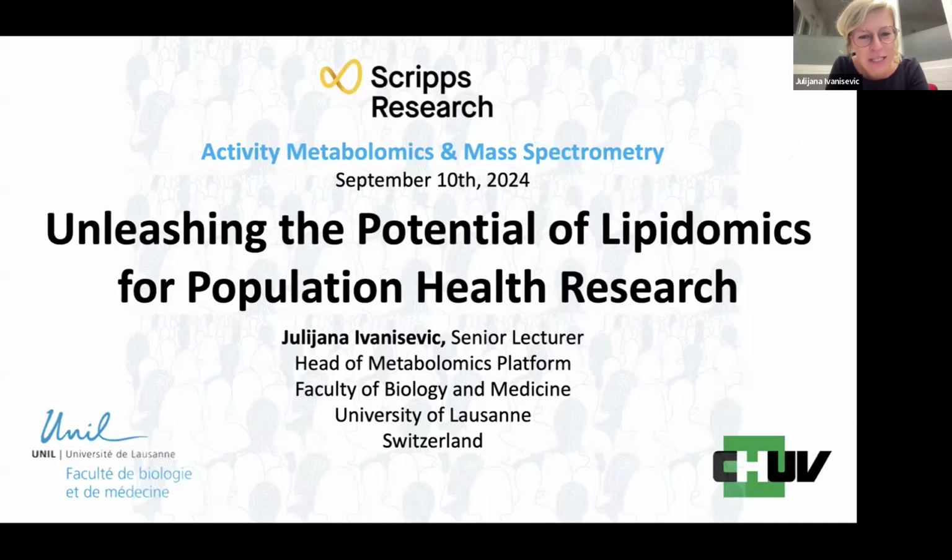I will first start by briefly introducing the problematics, and then I will focus on the analytical platform we have built for lipid measurement at a very large scale, from the perspective of the sample size, but also the lipid coverage. And at the end, I will share with you some preliminary results we have obtained so far through the profiling of the Lausanne population, which nicely demonstrate the sex specificity and the high individuality of our circulatory lipid signatures.